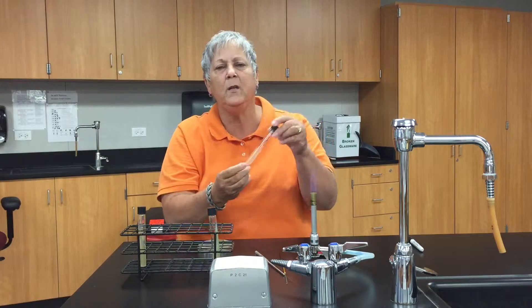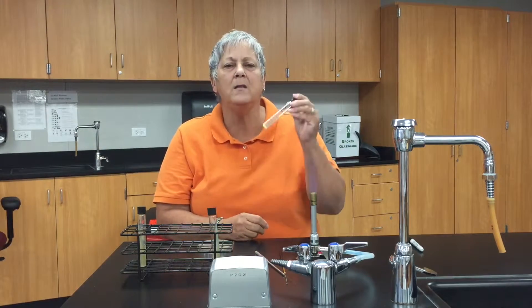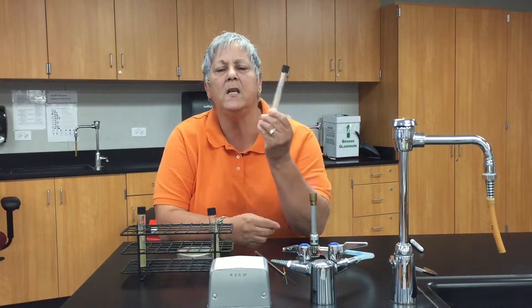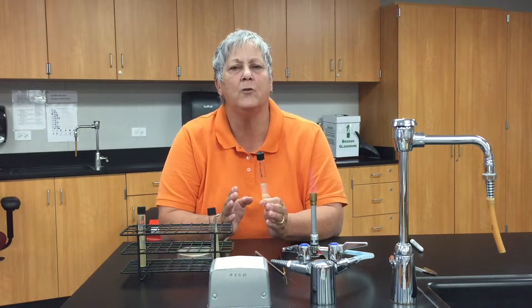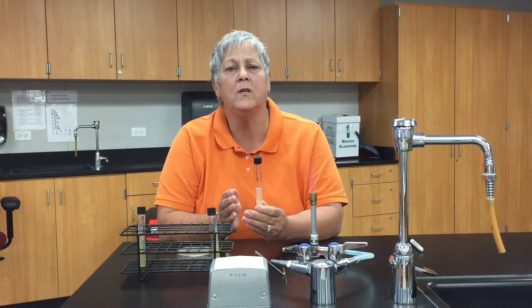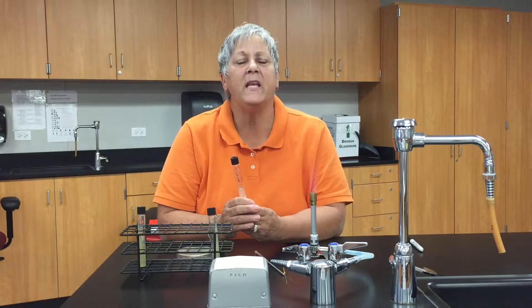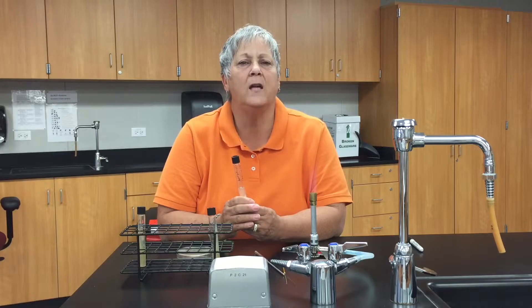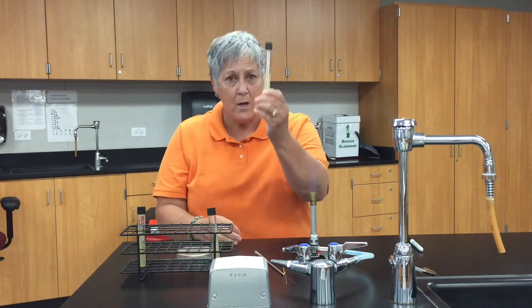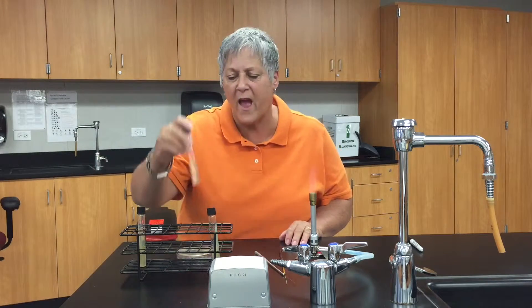Here is a tube of motility media — we call this a motility media deep — and it's a semi-solid media. It contains an ingredient called tetrazoleum. We add tetrazoleum so that as the bacteria grow in this media, the tetrazoleum will turn pink, making it easier to visualize and interpret our results after incubation. I will use my inoculating needle for that operation.